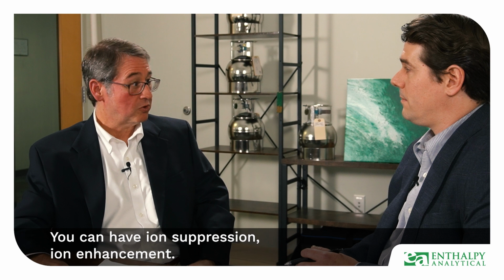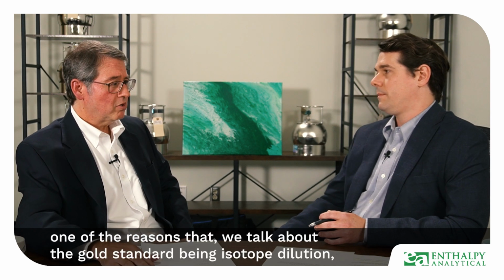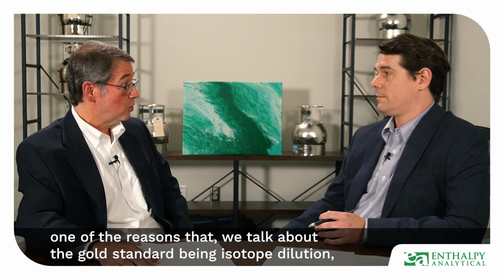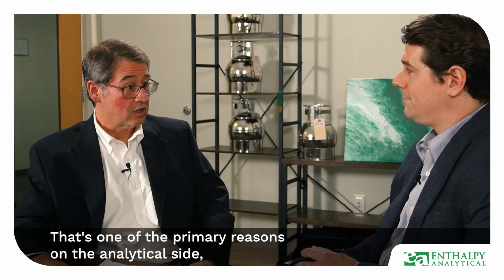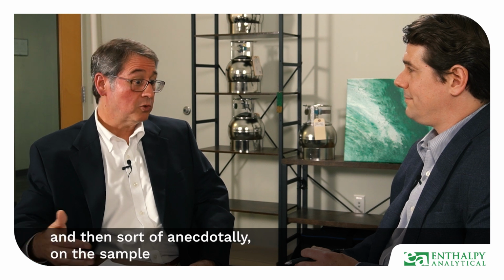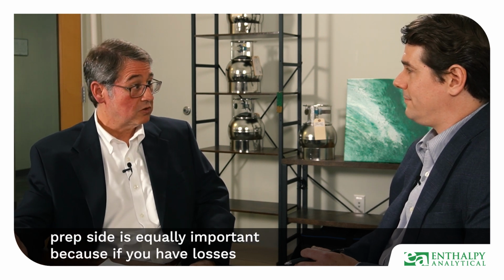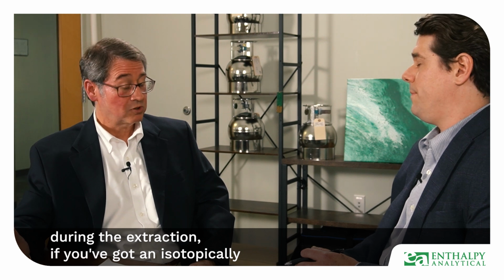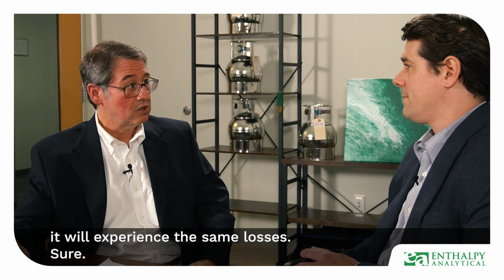You can have ion suppression, ion enhancement. And when you've got that going on, if you don't have a good isotopically labeled standard, it can throw your quantitation. Sure. So that's one of the reasons that we talk about the gold standard being isotope dilution. That's one of the primary reasons on the analytical side. And then, sort of anecdotally, on the sample prep side, it's equally important, because if you have losses during the extraction, an isotopically labeled standard that's been spiked prior to that extraction will experience the same losses.